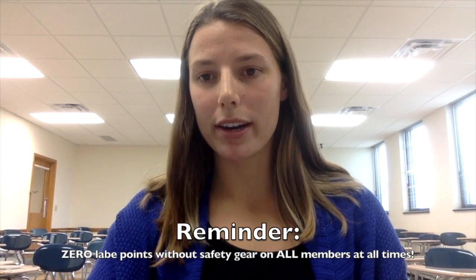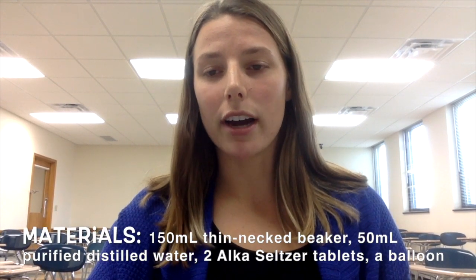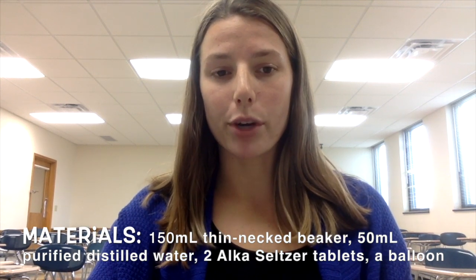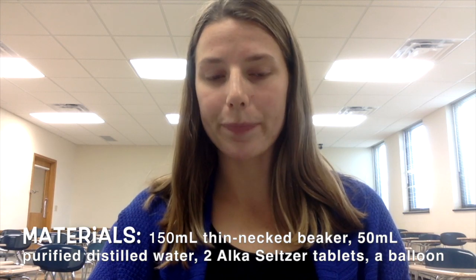After grabbing and putting on all your safety gear, you're going to grab your lab materials. For this lab, you're going to need a 150 milliliter thin-necked beaker, 50 milliliters of purified distilled water, 2 Alka Seltzer tablets, and a balloon.